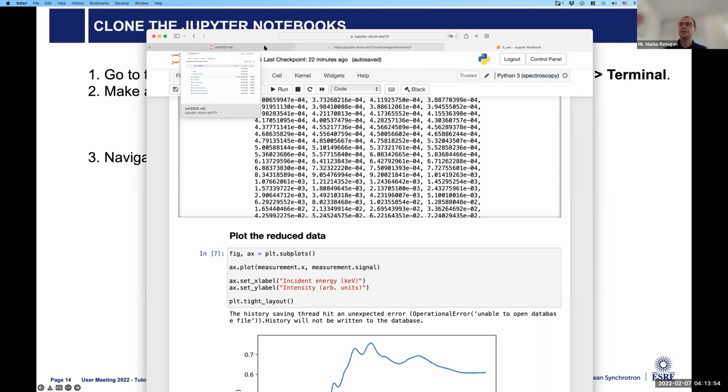That's the whole complication of not having a standardized way to store data on disk: every new library that is being developed has to do this. Another thing I see happening in the X-ray spectroscopy community is the Athena type file format, which maybe you used.